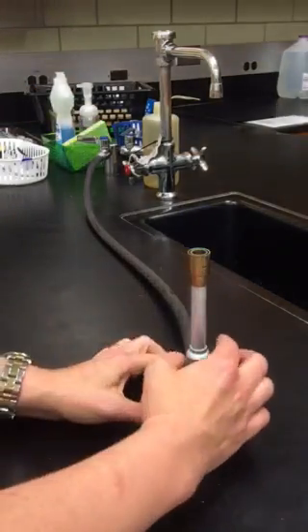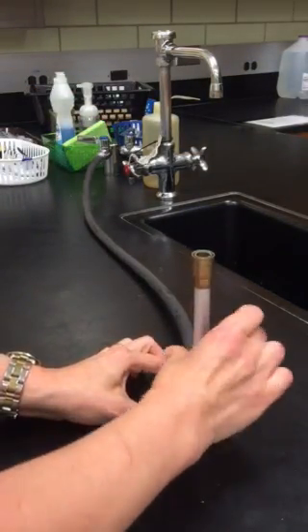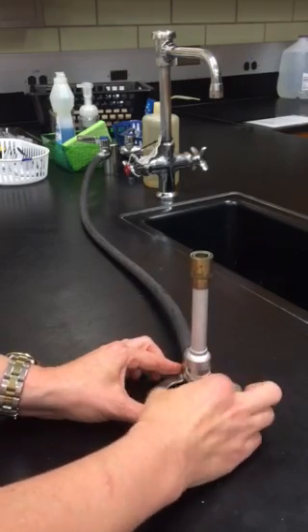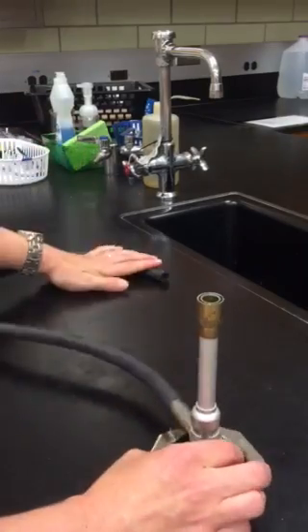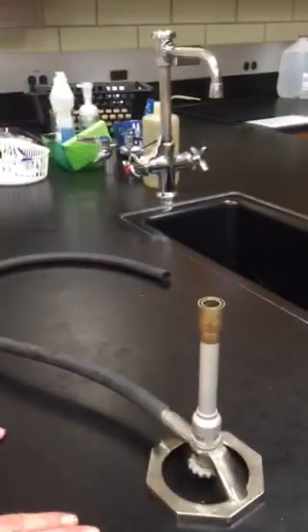Then to get this ready for the next person, I twist my barrel closed, close the gas valve, and detach the hose from the jet. And it's ready for the next person.